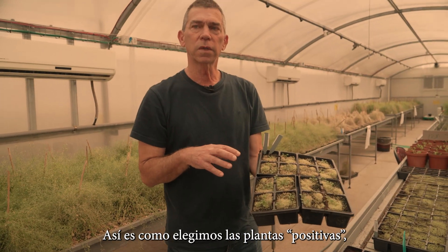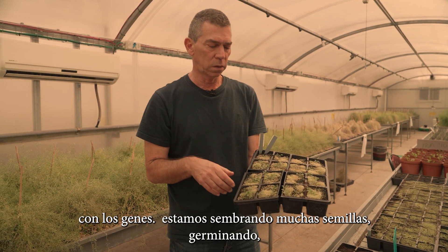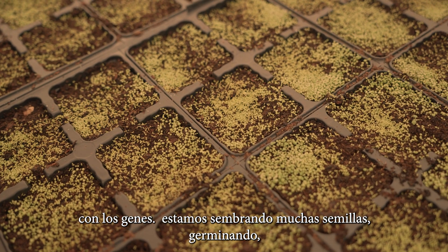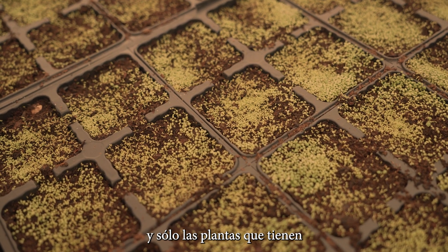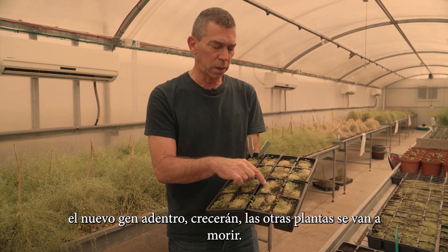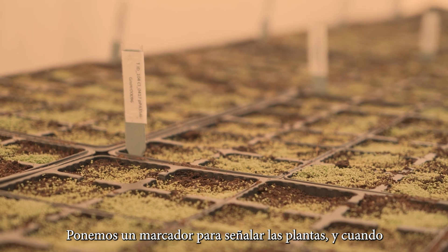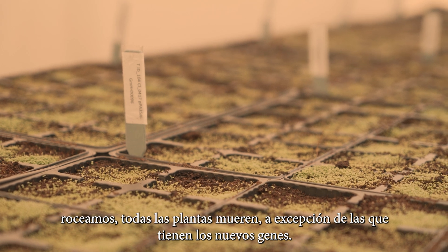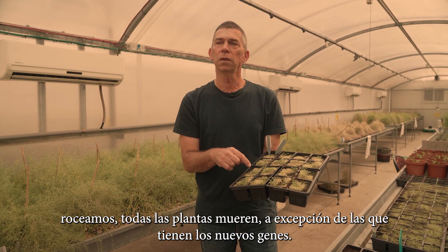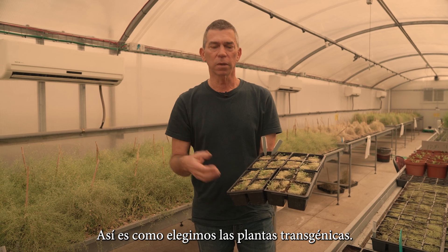This is how we select the positive plants with the genes. We sow a lot of seeds here and they germinate, and only the plants that have the new gene inside will grow — the other plants will die. We put a selectable marker in the plants, and when we spray, all the plants will die except the ones with the new genes. This is how we select the transgenic plants.